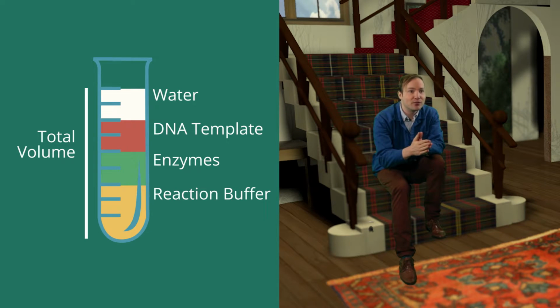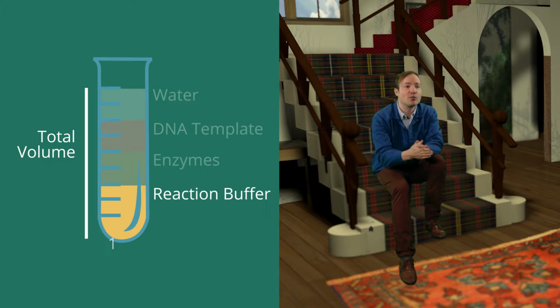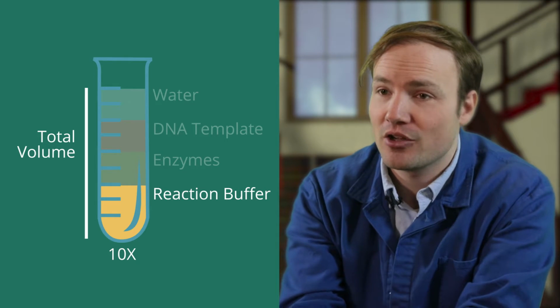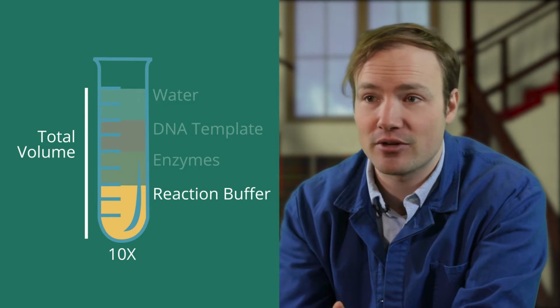The total reaction volume dictates the volume of the reaction buffer. These are almost always supplied at a 10x concentration. So that means in a 50 microliter reaction, we'll use 5 microliters of reaction buffer.